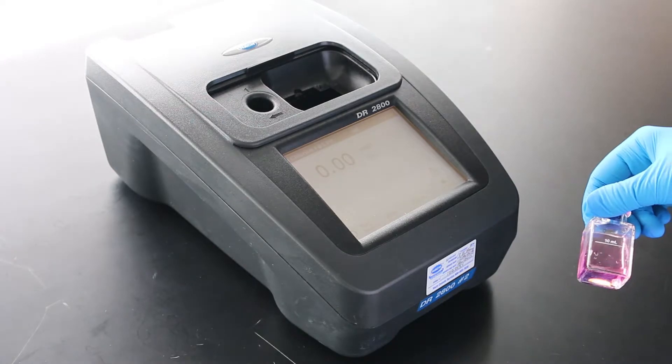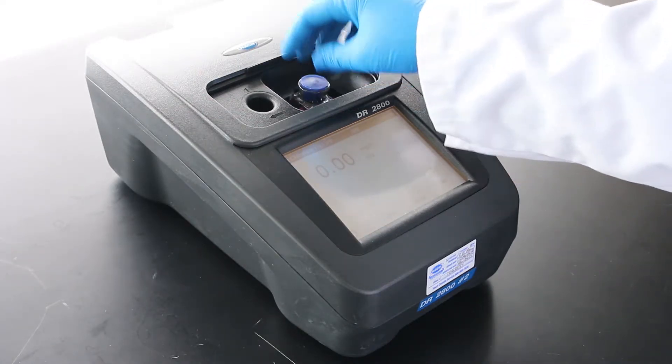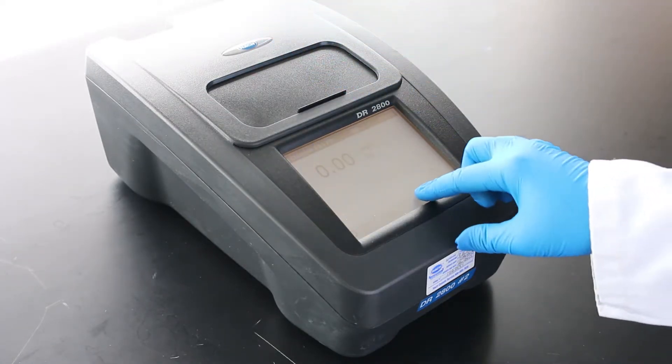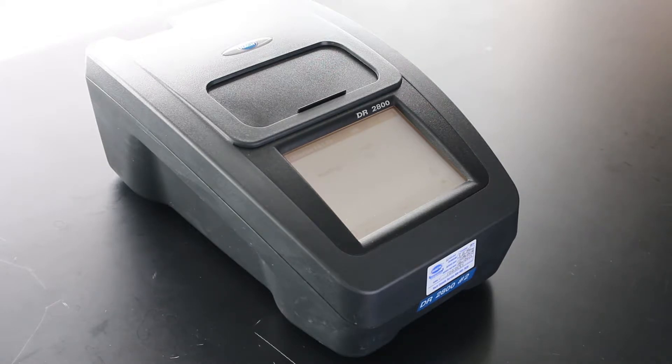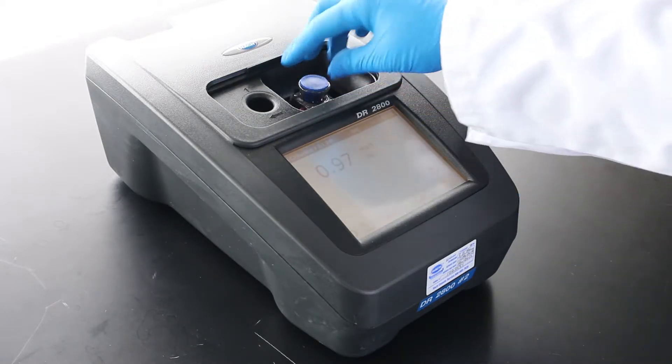Within three minutes after the timer expires, insert the sample cell into the instrument and read the sample. The results will show in milligrams per liter of chlorine.